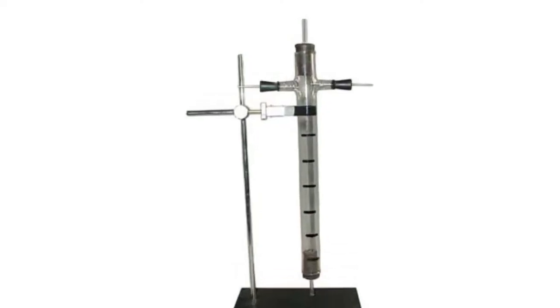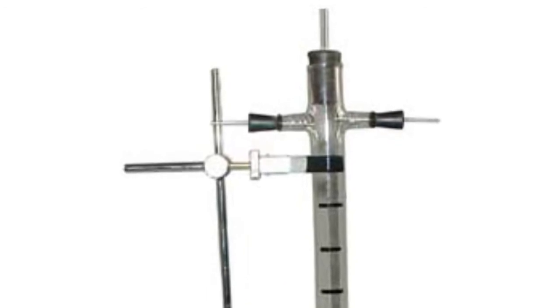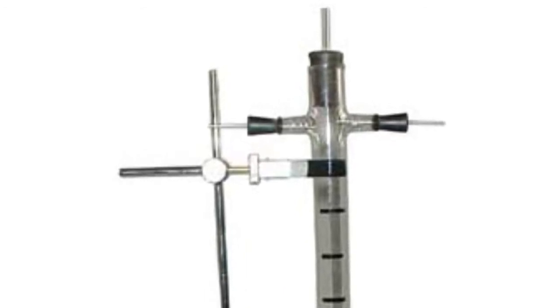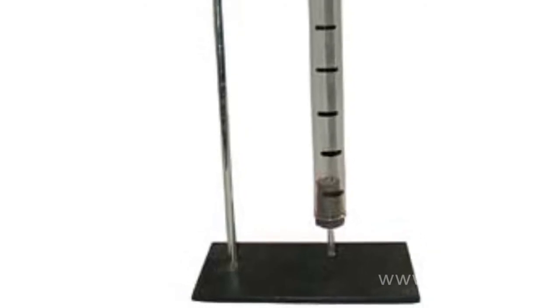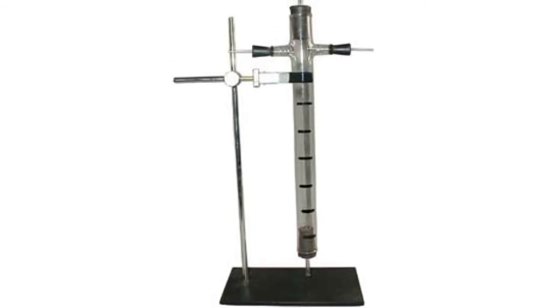Today's laboratory eudiometer consists of a glass tube package with two taps that have electrodes inserted into them through rubber stoppers. The upper and lower part of the package are closed by rubber stoppers with glass tubes. The package has markings that divide its volume into equal parts.